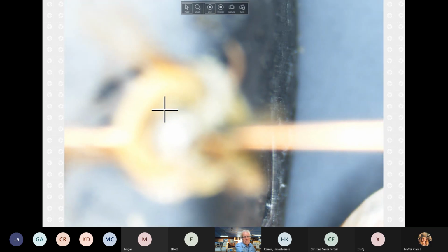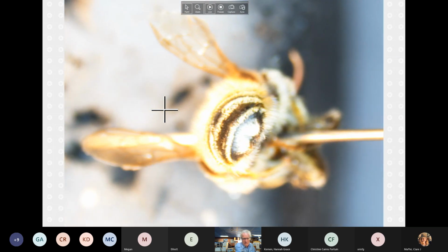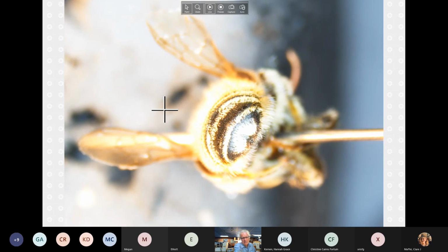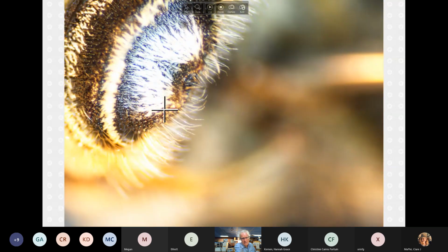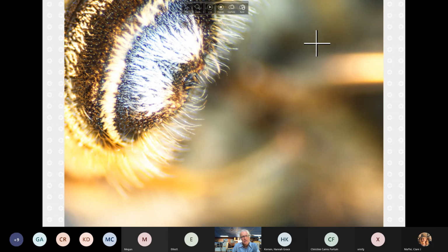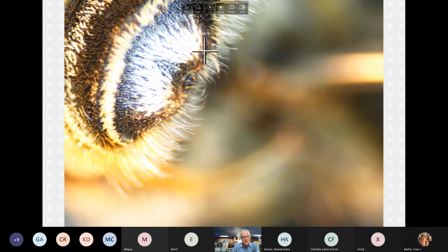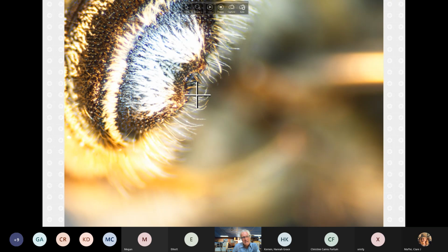Okay, here we go. We have a male here. What species is that? This is brevis. Okay, so what you're looking at here, under normal circumstances, you would say, okay, here's T7, and here's the rim of T7, right? So here's this notch. That's what we're talking about. Well, a lot of species have a notch in T7. And brevis, you can see that brevis is a good one. You can see there's a bunch of teeth here.